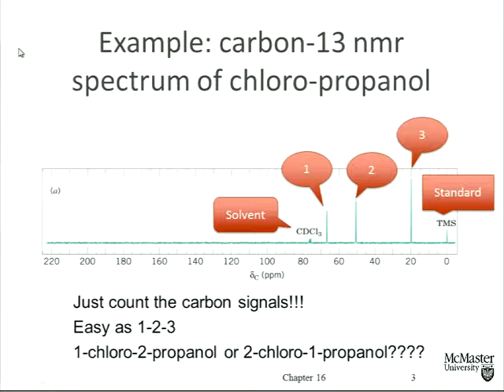First of all, there's a spectrum, and this time it's the opposite of infrared. When things absorb, we get peaks. So the baseline runs along the bottom, and peaks run upwards. Okay? Makes more sense than infrared. Infrared, as we mentioned last week, is traditionally done in the opposite way. The baseline runs along the top, and when things absorb, we get a trough, essentially, as somebody put it very precisely. So here's our baseline.